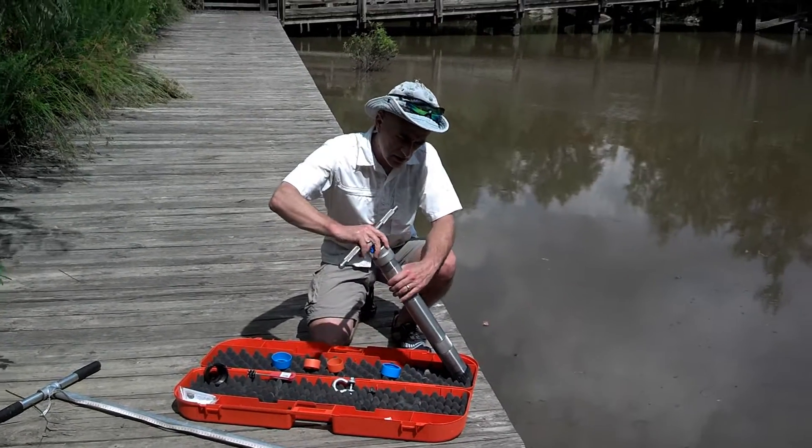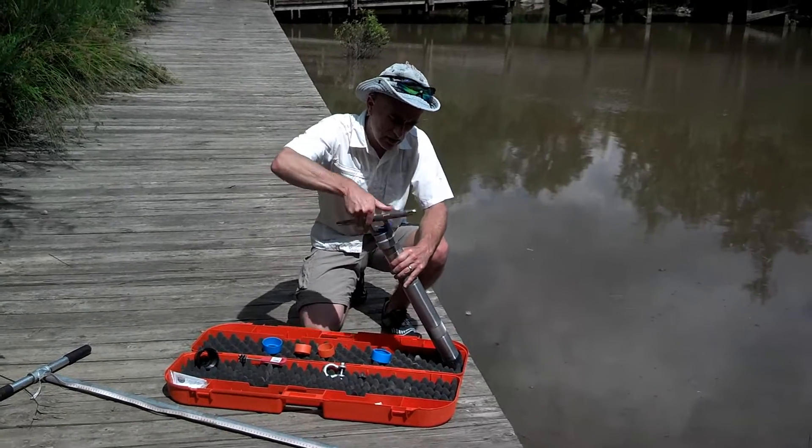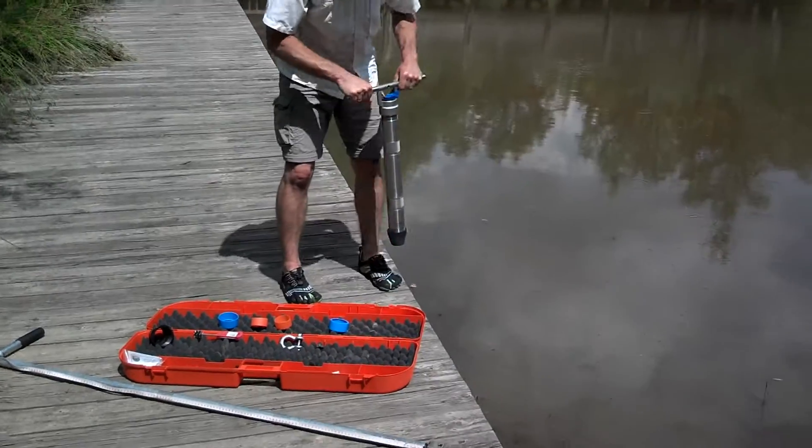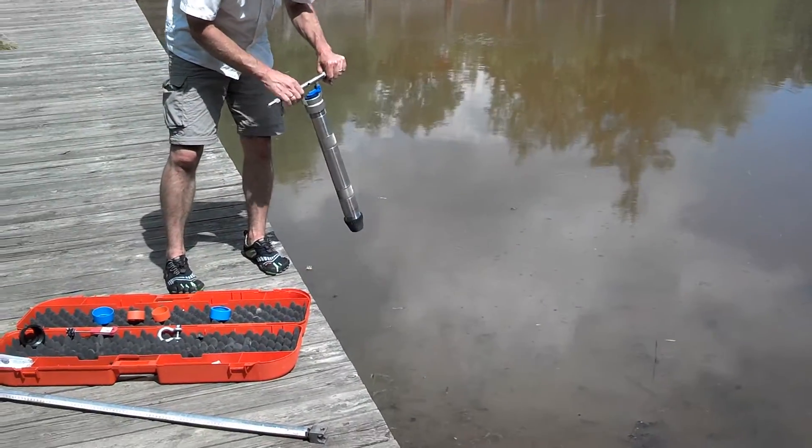Next we'll put on the handle. And we'd be ready to take this out into the lake and push it down into the sediment to retrieve some core.